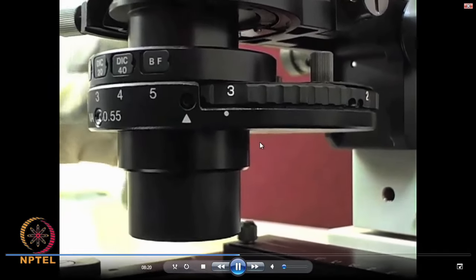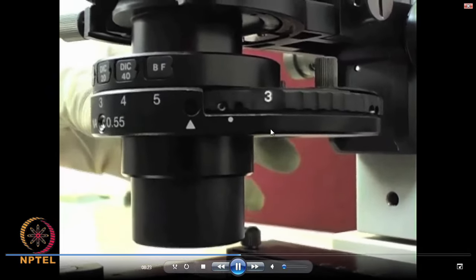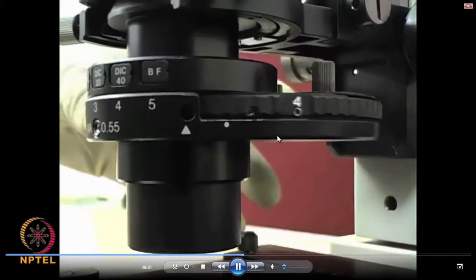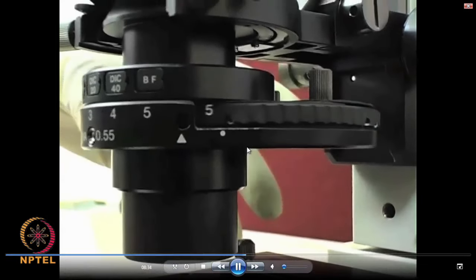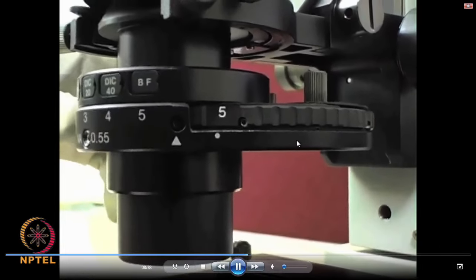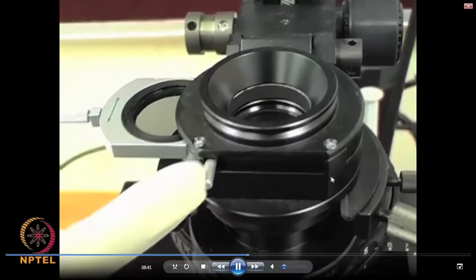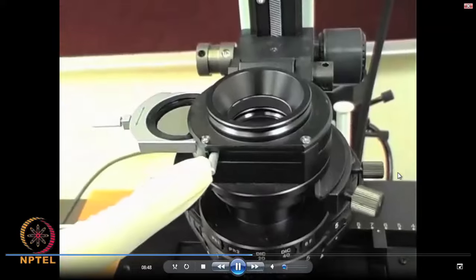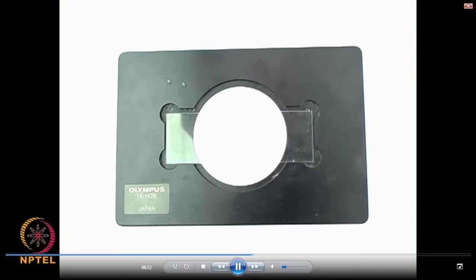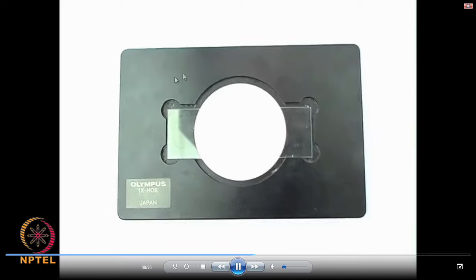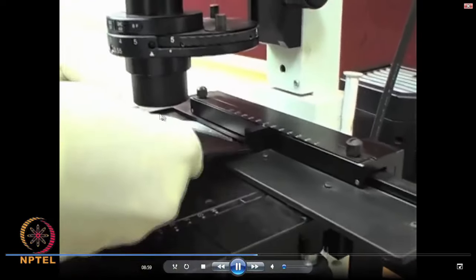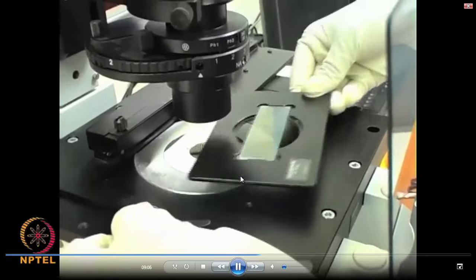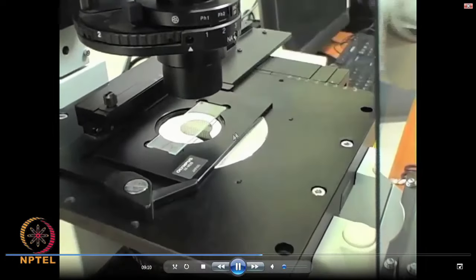I just want to introduce the kind of hardware — you should not think that every microscope variant requires a completely different microscope. It is just the aperture, condenser setup, and filters which make the variants of microscopy. This is the specimen stage — remember, this is a transmission optical microscope, so you have a transparent window where you can keep your thin transparent sample on a glass slide and then start viewing it.